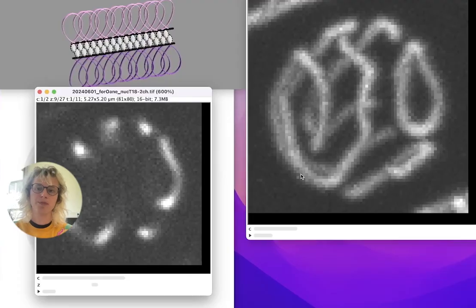Welcome to the first video of volume rendering in TIFF2Blender for fluorescence imaging. Let's take a look at what our data looks like.